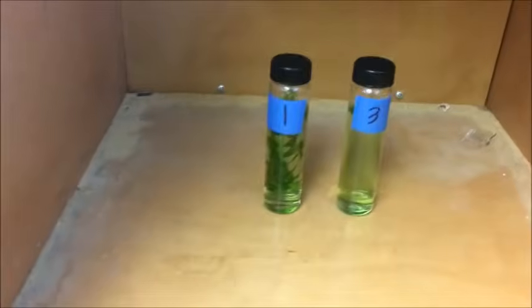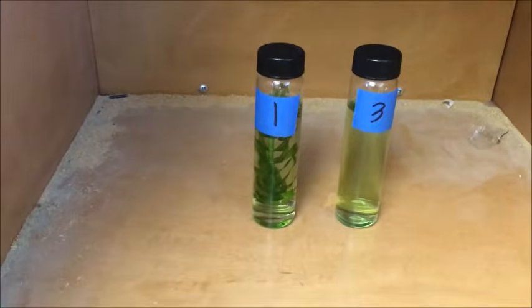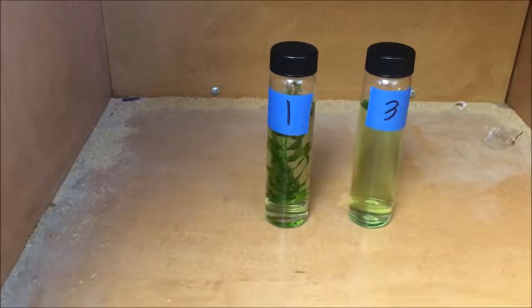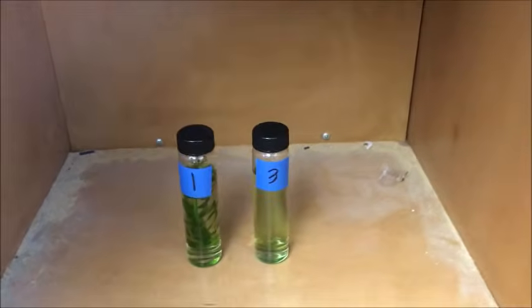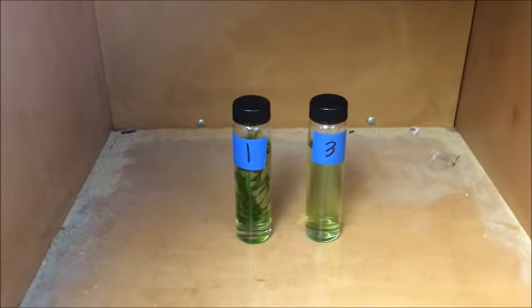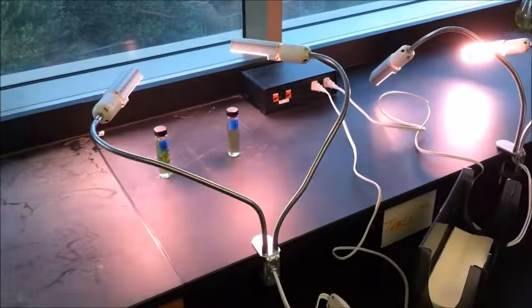Now, in one of my cupboards right here, I have tubes 1 and 3. So again, tube 1 has the Elodea plant, but will not receive sunlight. Tube 3 has no plant, and it will not receive sunlight. So I'm going to close the cupboards right there. I'll come back in 24 hours and show you the results.